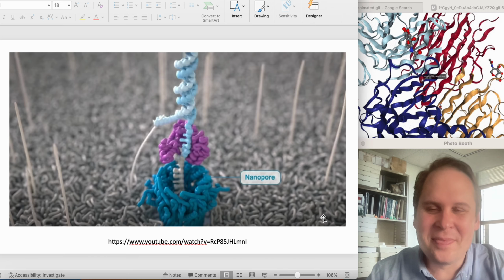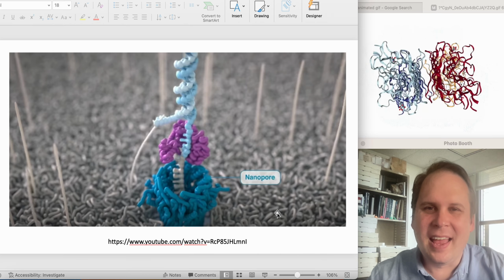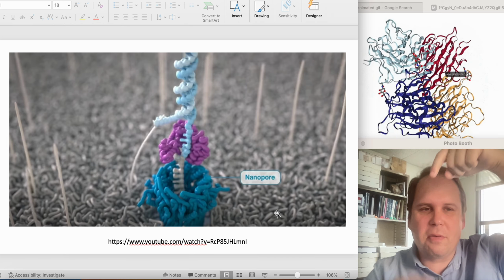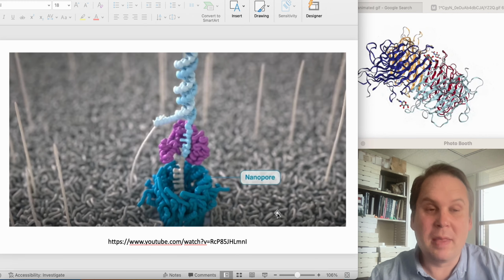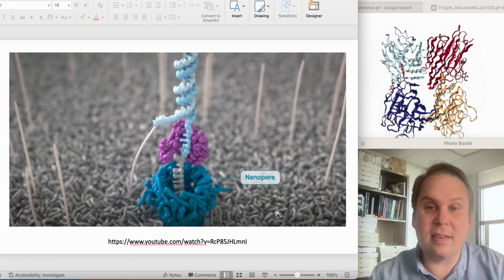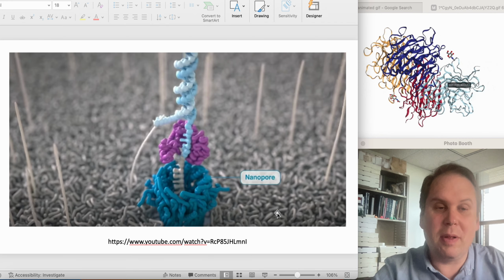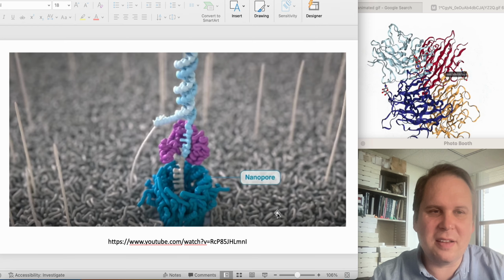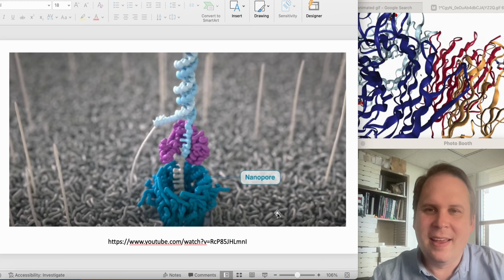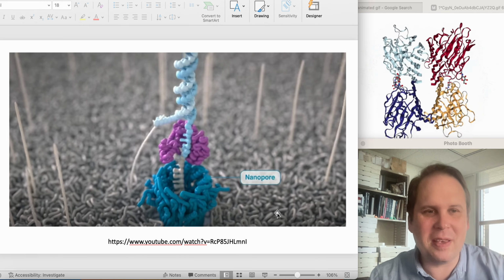So, a nanopore is a little tiny pore, and the DNA goes through the pore and gets sequenced as it goes through. So basically, all you need is some kind of little hole of consistent size and a way to push or pull the DNA through that hole. Yeah, like spaghetti into a toddler's mouth. Slurp. And there you go. You will have nanopore sequencing.